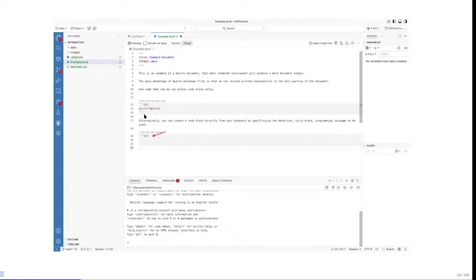If you don't want to go through the steps of adding in a code block by clicking on a location, coming back up here, inserting a code block, and selecting R, you can also just type this out as you go. Just be very careful to make sure you have 3 tick marks on each side, or else the file itself is going to get confused, and you'll have splices as far as one code block running into the other, including text. So those are the things to keep an eye on when creating it by hand.